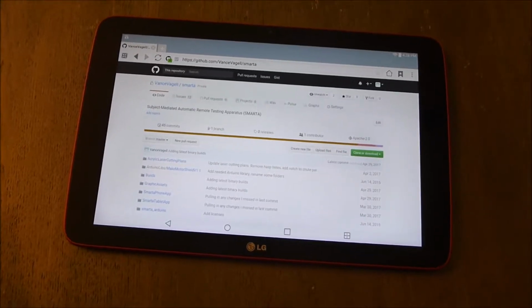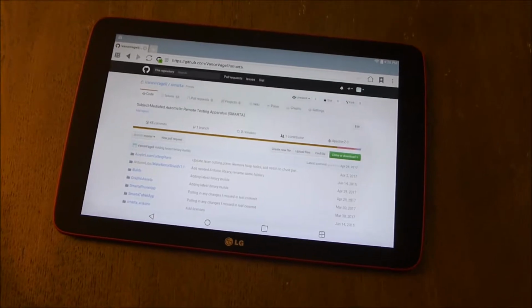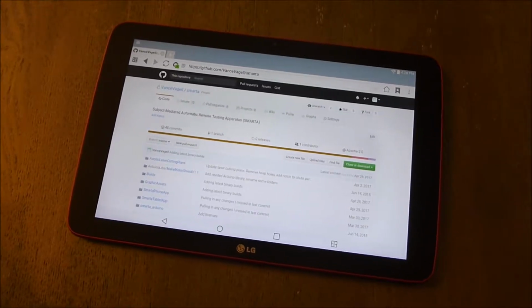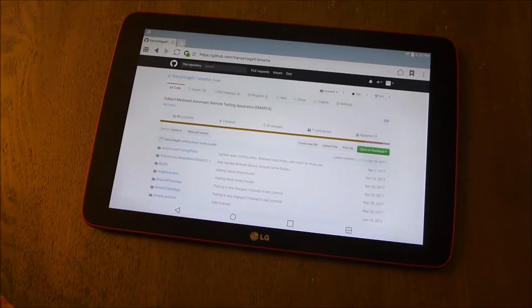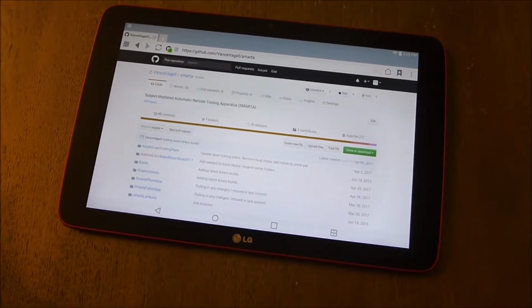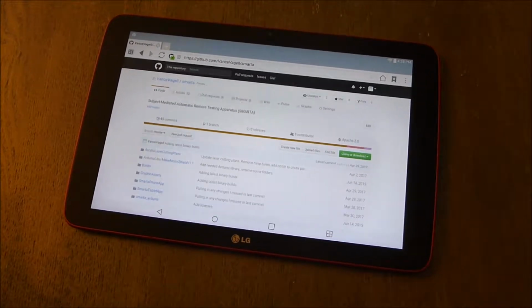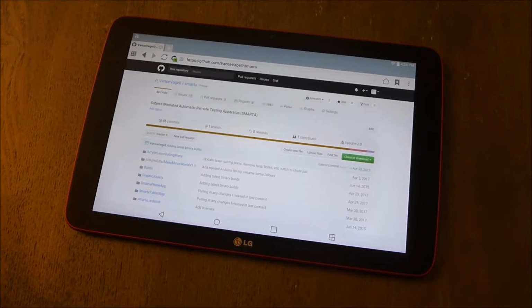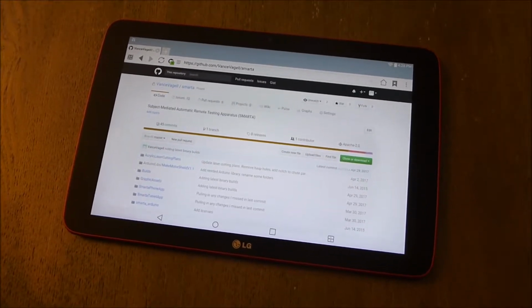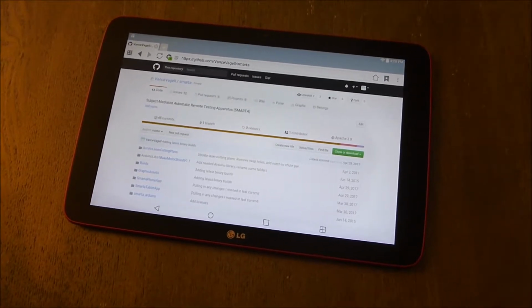Okay, so we're actually going to get started by installing the SMARTA tablet software. As I said in the introduction, for the purposes of this demo, we're going to assume you're just using the default SMARTA software, the one that's on GitHub. In reality, you'd probably want to have it customized for your particular research experiment, like with your animal names, but I would actually suggest you start with the default one. That way you can just make sure everything is working together, and then once everything's working, you can have it customized the way that you want for your research.